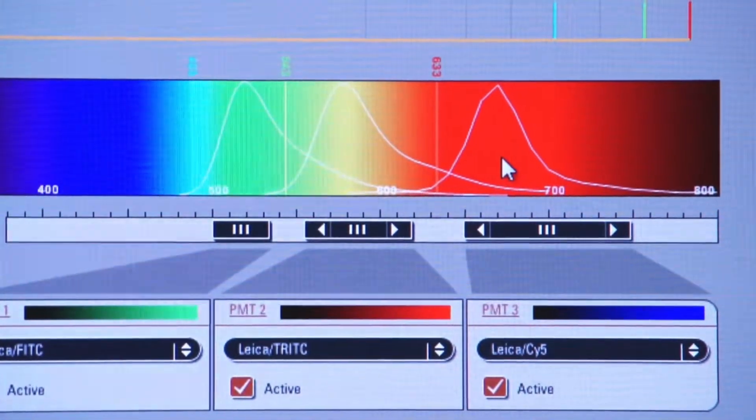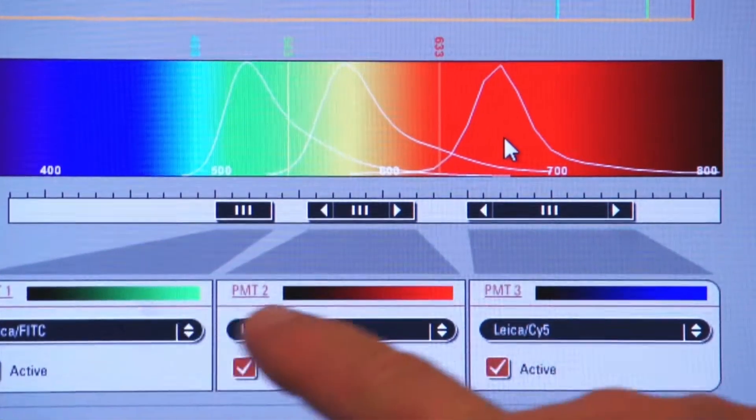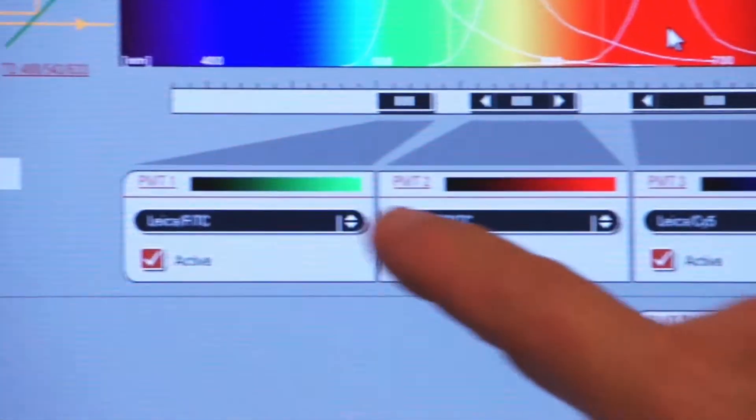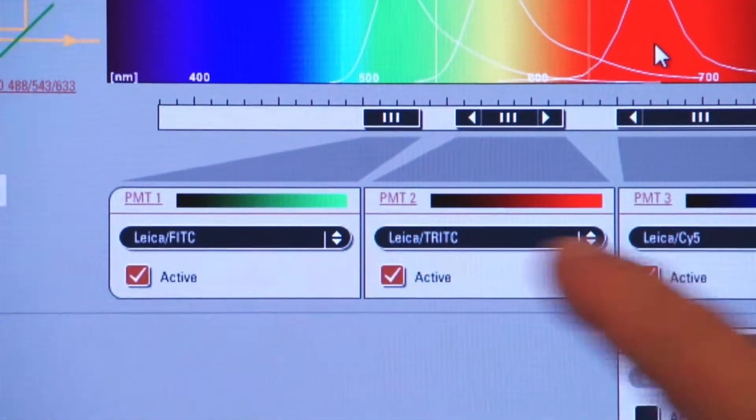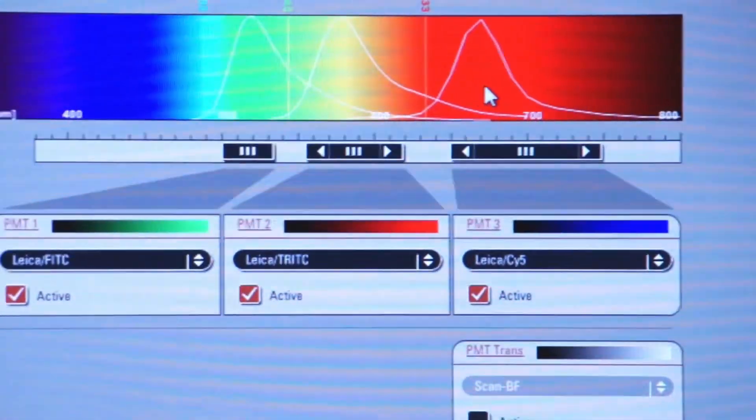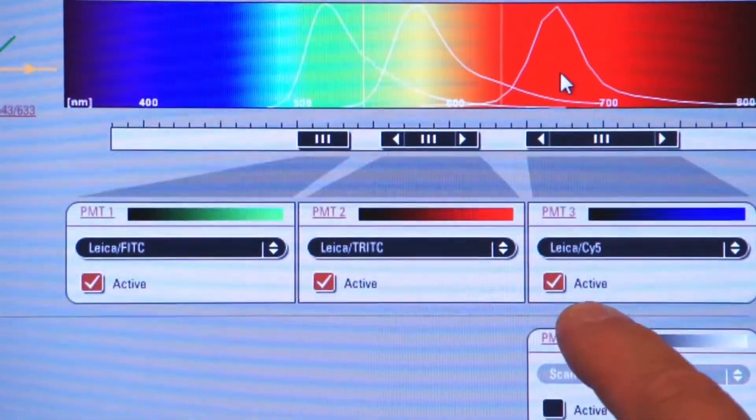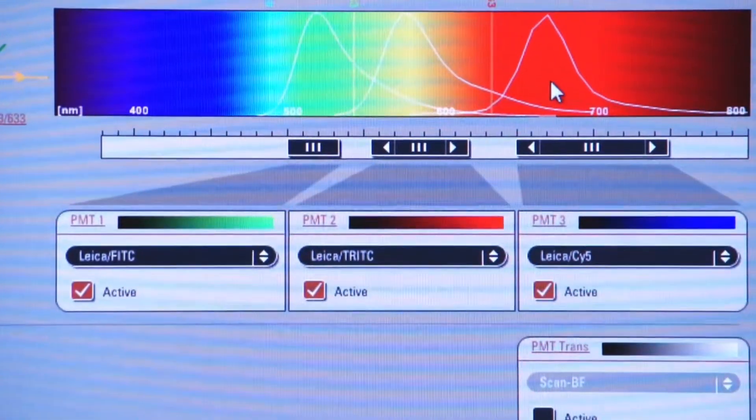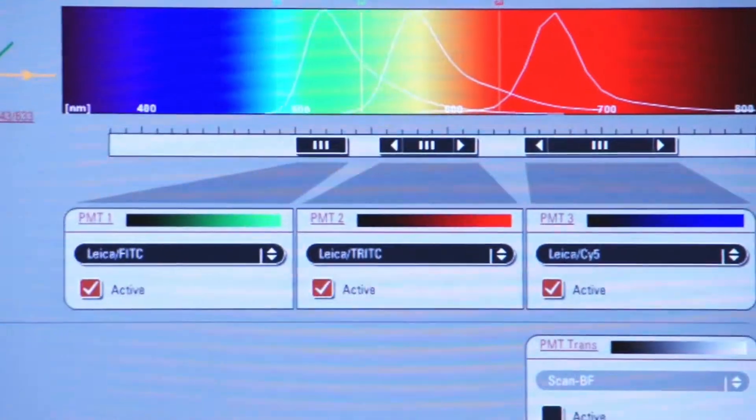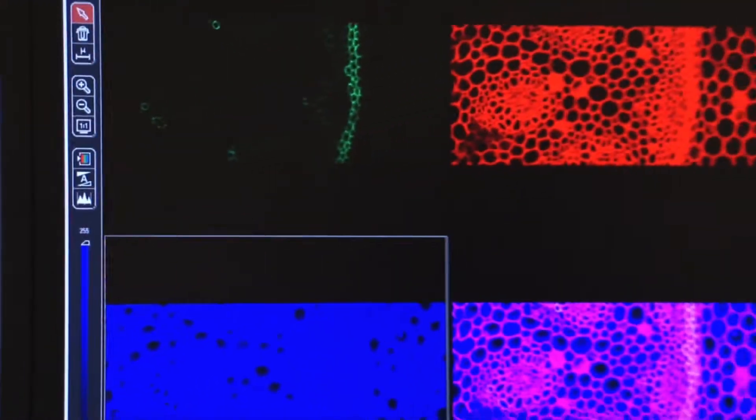We're going to be outputting our image in three colors: green, red, and blue. But we can also modify these colors as you'll see in a second. Also, please note that all three photomultiplier tubes are now activated. I'm going to click on Live, and if you look on the right screen, you'll now see an image with four windows in it.